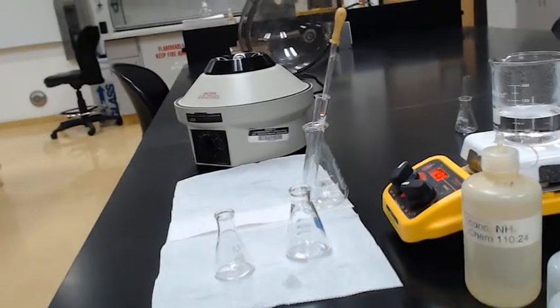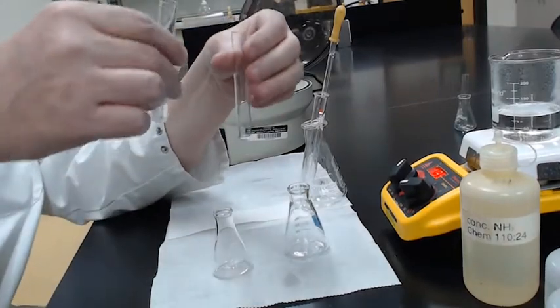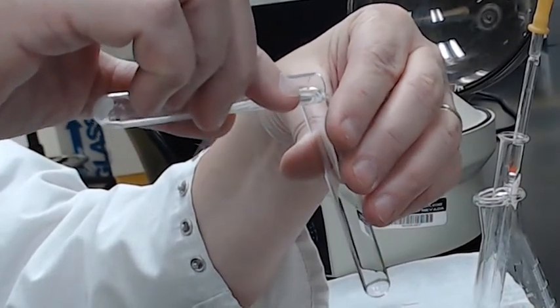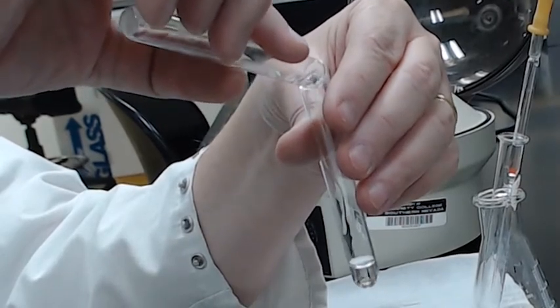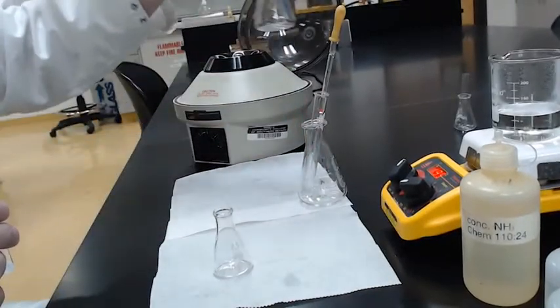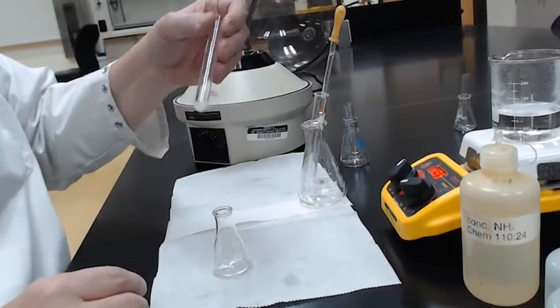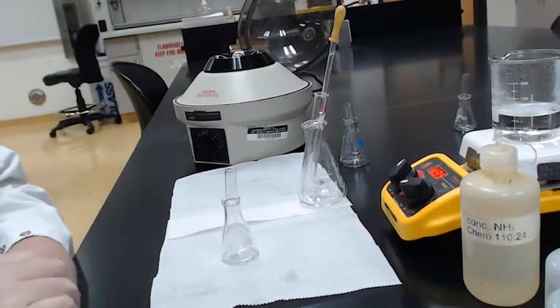We are going to decant very carefully the supernatant into a second test tube and save that decantant for a later part of the experiment. Okay. So we're going to save that and put it aside. And remember, this is what they call supernatant 1, and this is residual number 1 according to the procedures number 2. So we are now ready to begin procedure number 3.